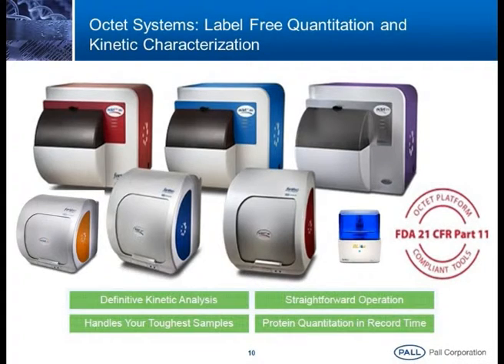So I will go through this. We have Pall Corporation. We have different platforms for designing experiments and performing them in discovery. Starting from a single channel, it is very small. In one hand you can hold it. It looks like our NanoDrop machine. Single channel, manually operated, one sample at a time.